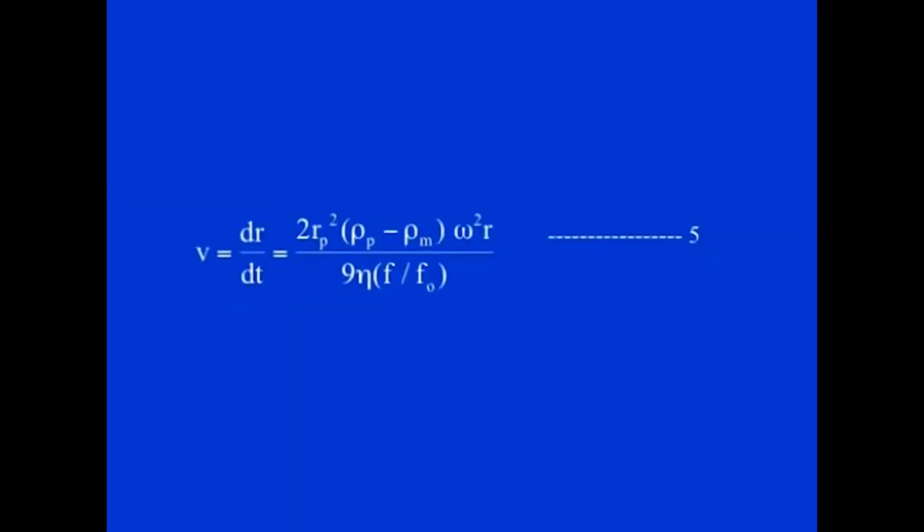These include, first, that it is directly proportional to the size of the particle, where I was telling you the radius r p of the particle. Since the equation involves the square of the particle radius, it is apparent that the size of the particle has the greatest influence upon sedimentation. If you recall, it is r p square, the radius of the particle, so it has quite a lot of effect on sedimentation. If the particle size is doubled, then the sedimentation rate will be much more.